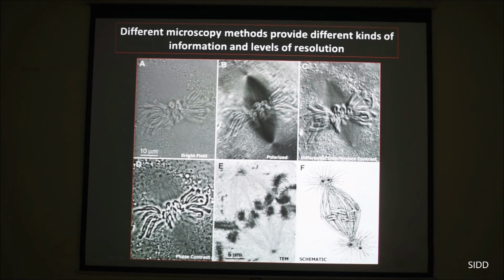This is of course electron microscopy, we get a much better view, much more resolved, and this is what people, when they didn't have all this facility, would do, draw it. And I'll show you later on an example how drawings can be much more meaningful than what we photograph. Because photography doesn't allow us to see everything that our eyes can see.